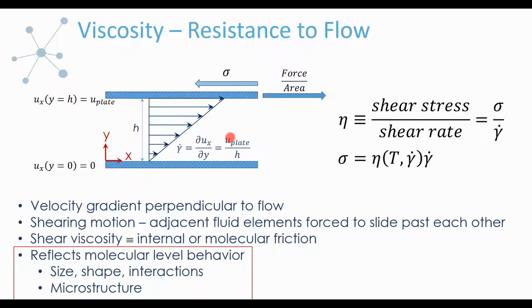So again, we're introducing deformation. We're going to characterize that deformation by the shear rate. And the shear rate is essentially just a velocity gradient in the fluid, which is perpendicular to the flow field.